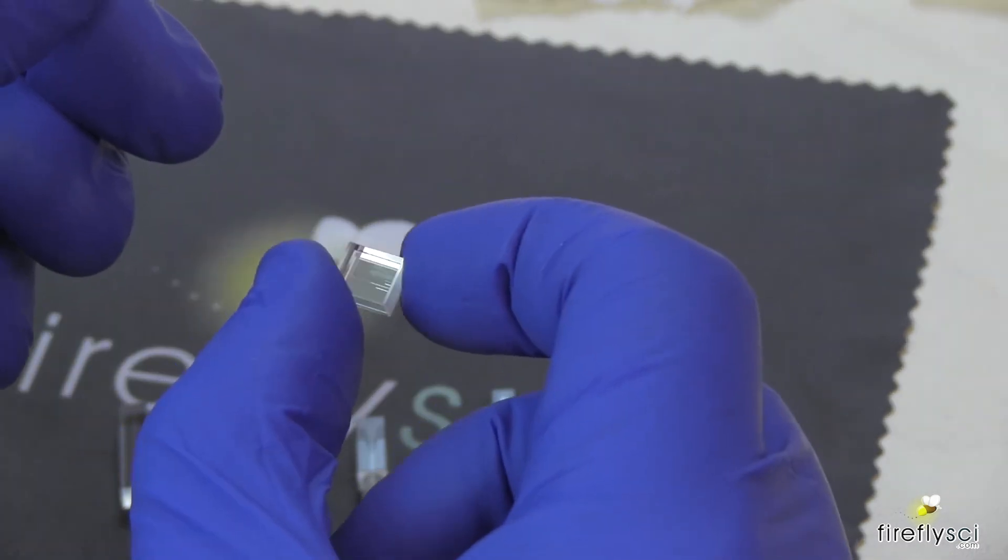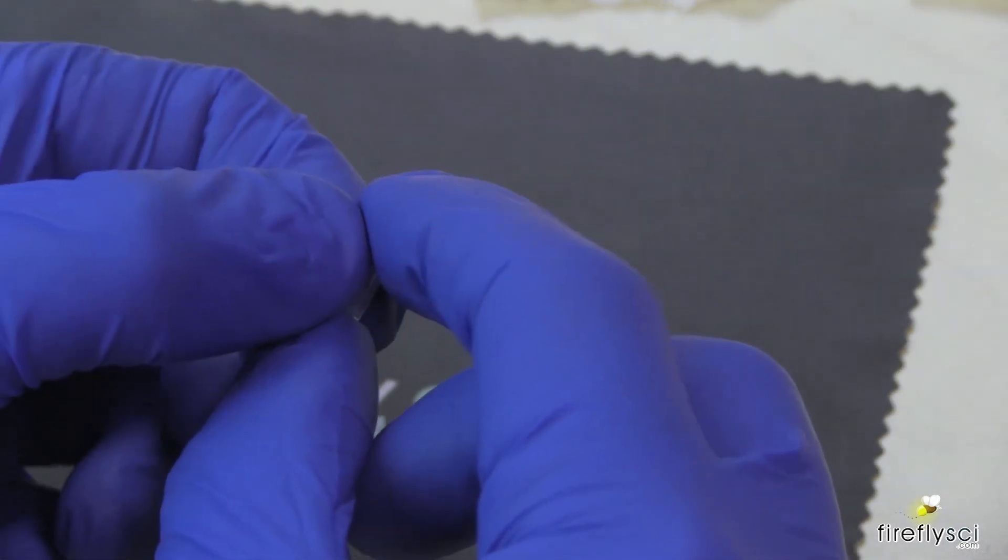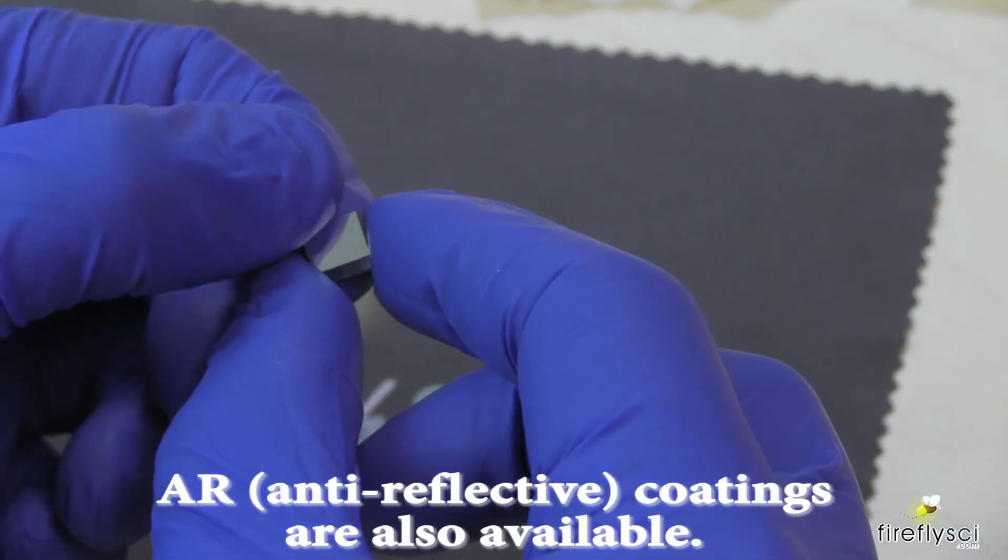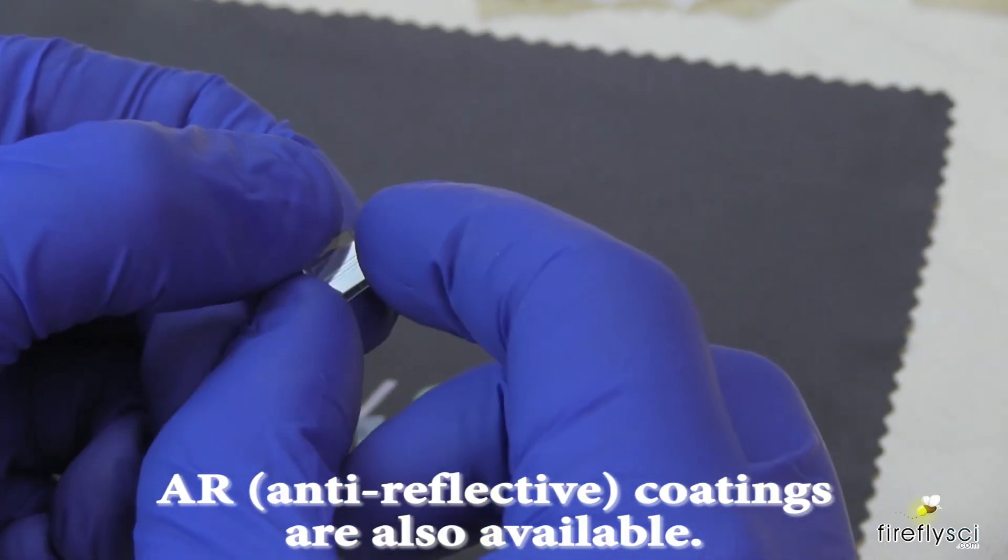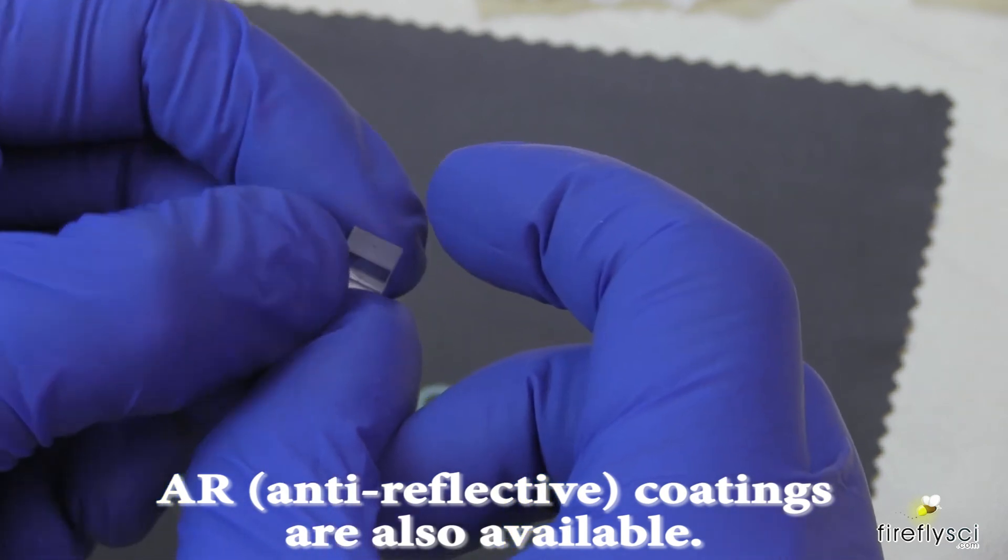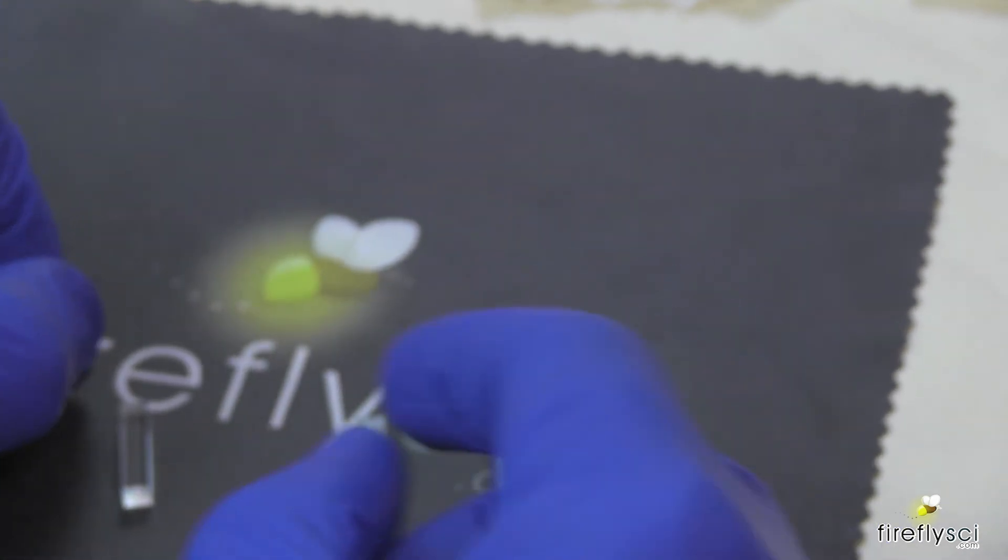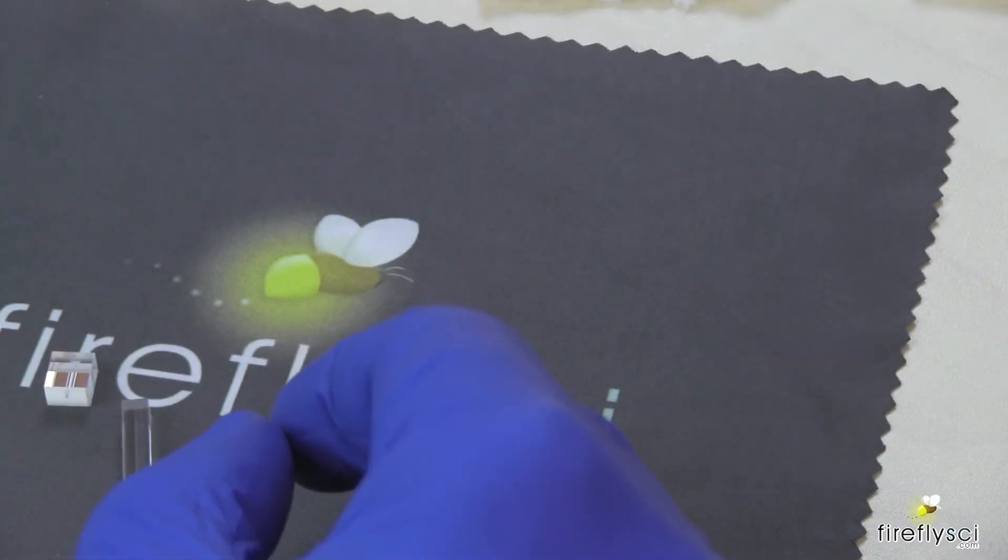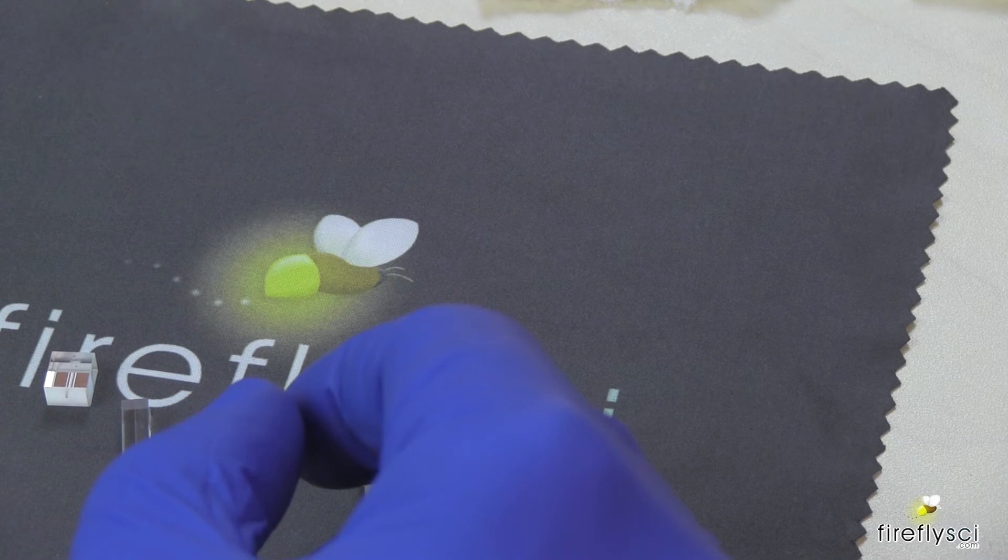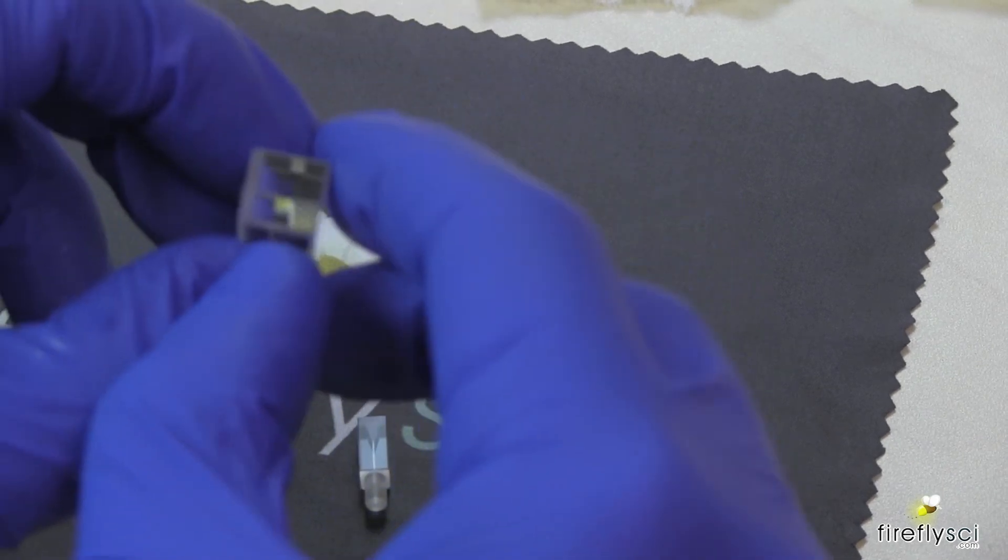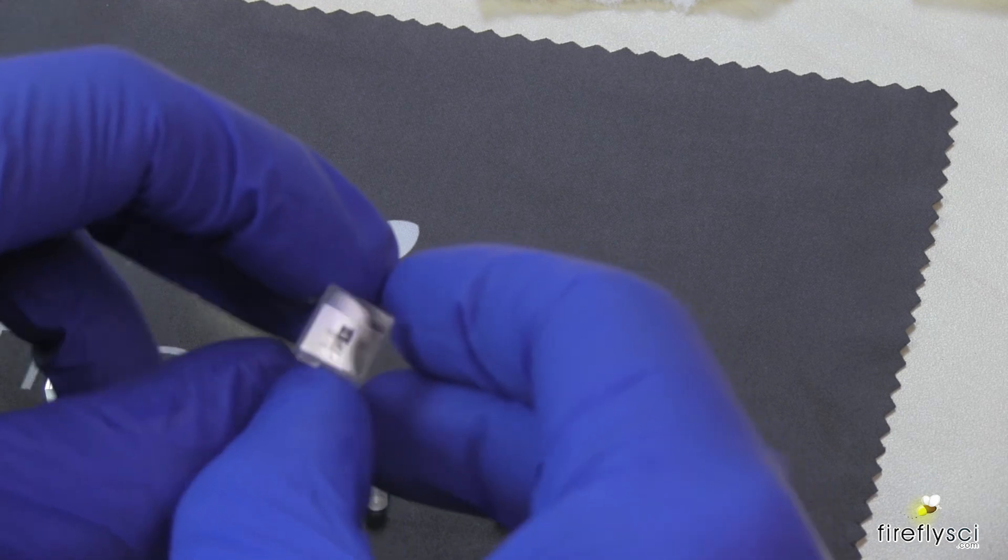This flow cell here has a mirror coating on the back. Some flow cells have frosted ends and some flow cells have the ends polished. Let me find a polished end one to show. There it is. This flow cell here has polished ends.